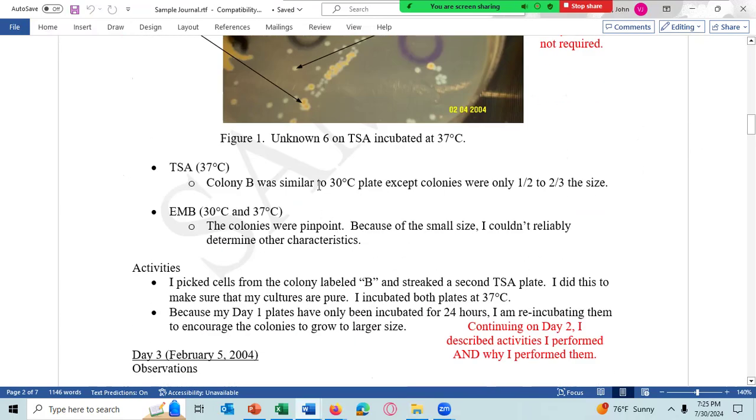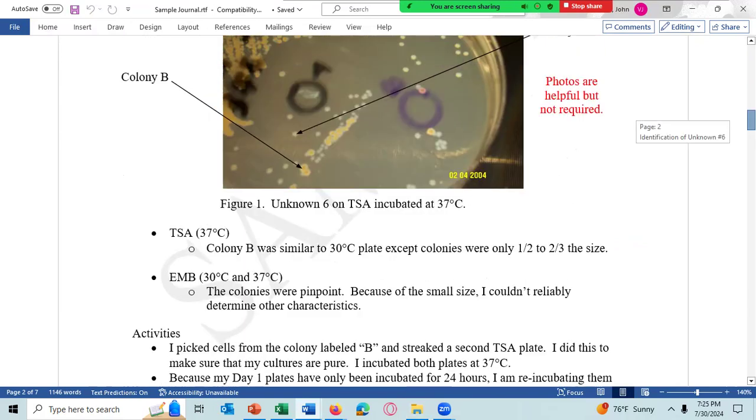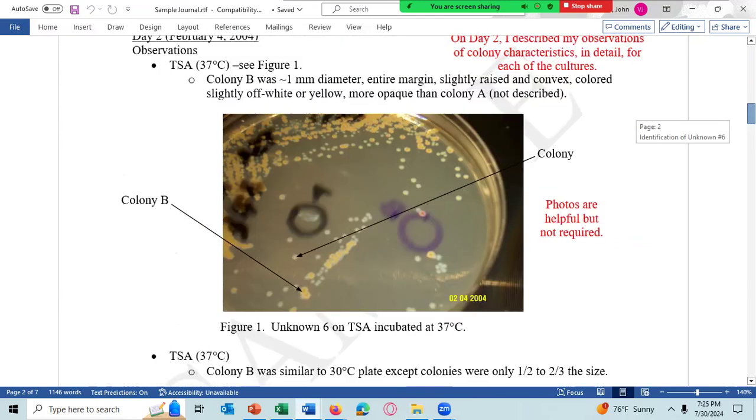And so the very start of this, in a sense, you're kind of skipping, and that is because you're getting a pure culture from the start. We just started with the online class that we would send you just one number, and then you have that pure culture to work with at the start. But you should pretend to streak it out.